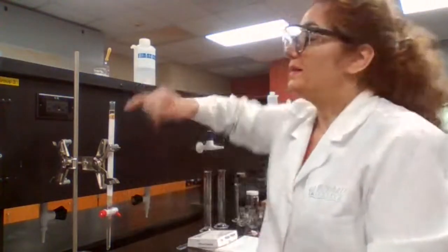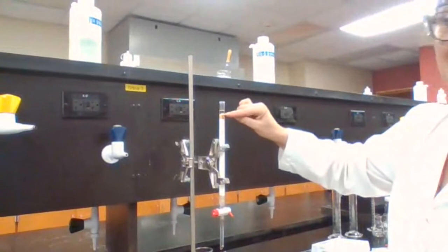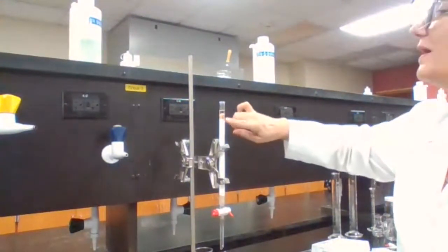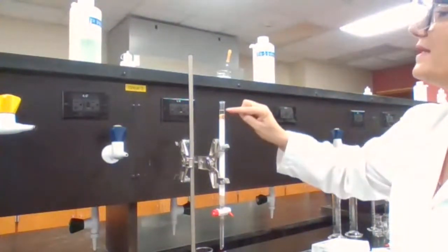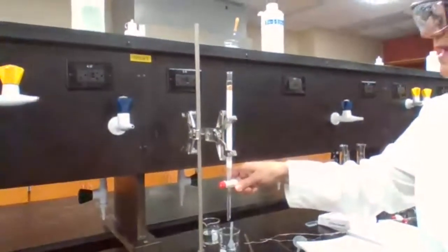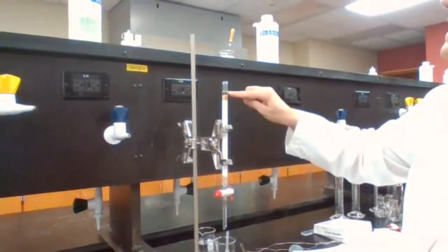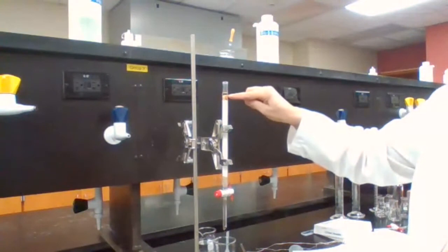Run the level of the liquid, it's talking about this liquid. The level of the liquid now is higher than the sand. So when you say run it below the sand, I'm just going to open the stopcock here. So I'm opening the stopcock to bring the level of the liquid, which is the hexane, to the top of the sand. Okay?